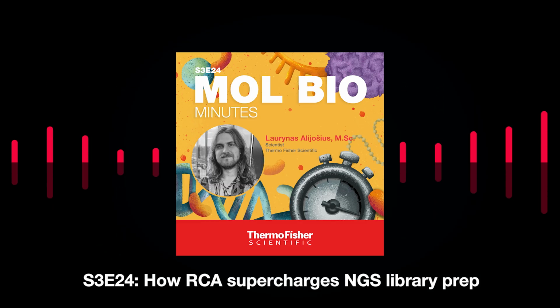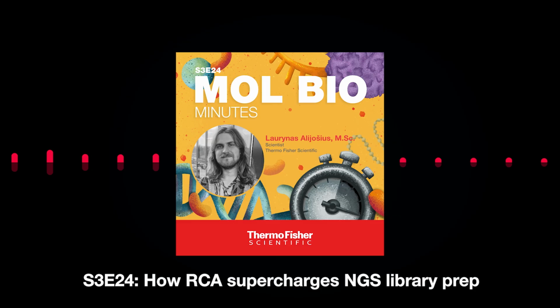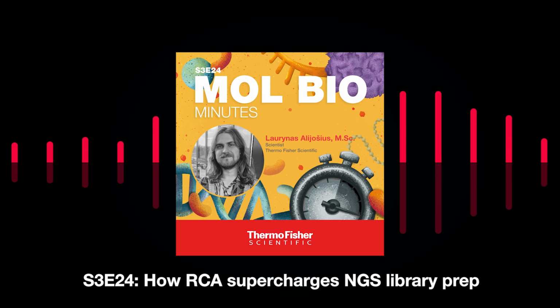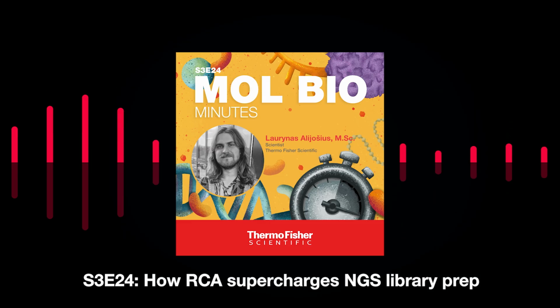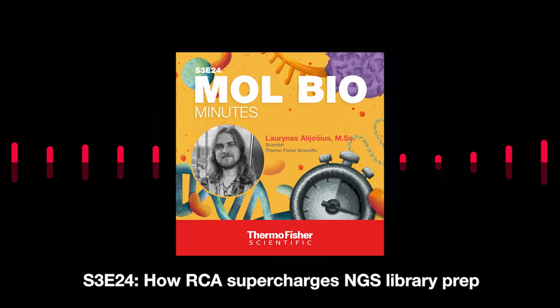But what is the main element of the RCA method? It's the DNA polymerase. And usually, it's a Bst or Phi29 DNA polymerase that is used for the RCA reaction. However, Phi29 DNA polymerase is much more popular and it is the whole crowd's favorite here because it has proofreading activity and that makes it a high fidelity polymerase.